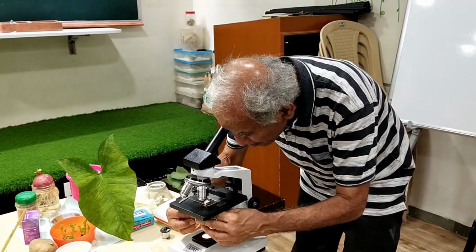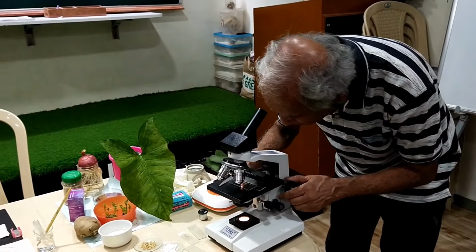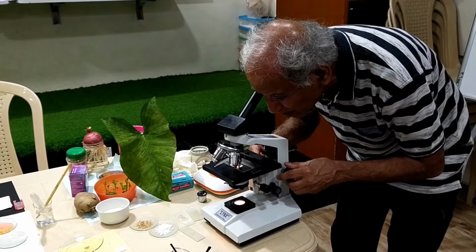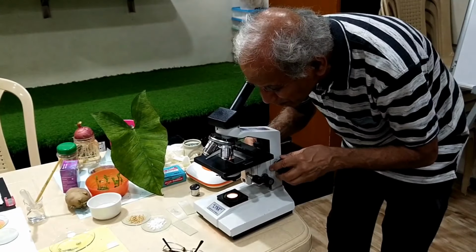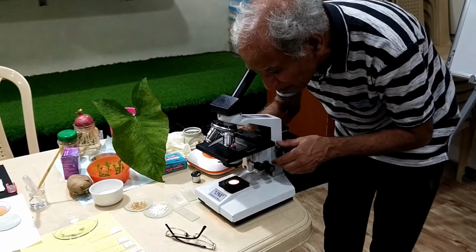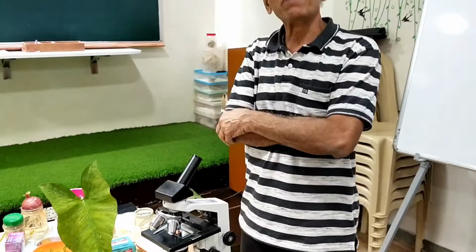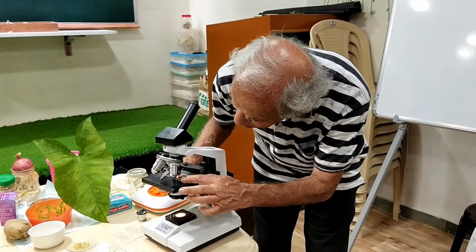Okay, I'll bring it in focus first. Adjustment will require a little practice, and many times it takes more time. That is also normal. Some of you might have handled microscopes in your schools, and maybe you have your own microscopes at home. If you are in the medical field, probably a microscope is more likely to be there.